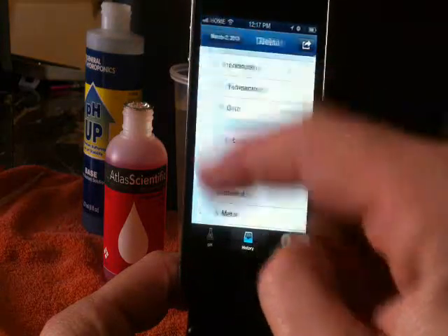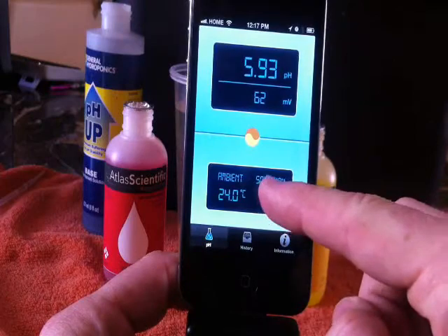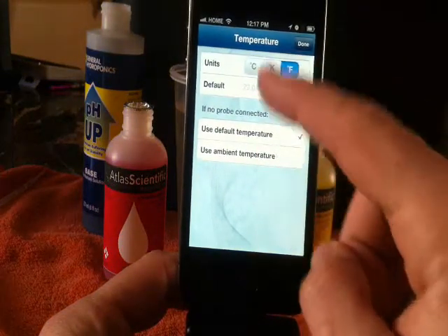One of the features it has is you can change the temperature from Fahrenheit to Celsius to Kelvin. You can decide which way you want it to go — very simple.